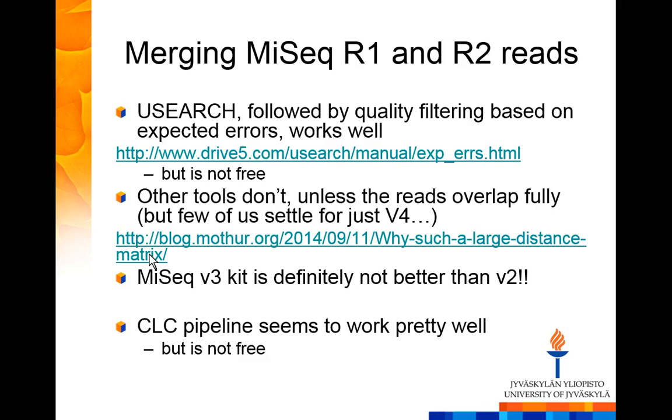So probably much of the unique sequences or funny things that we saw in the MiSeq data were because the original merge and quality filtering embedded in the merge tool did not work perfectly. And Pat Schloss, the maker of mothur, tells it all the time: yes, it doesn't work, you should have full overlap.